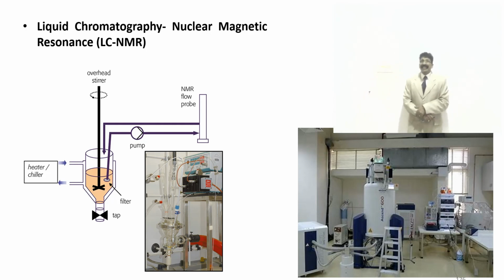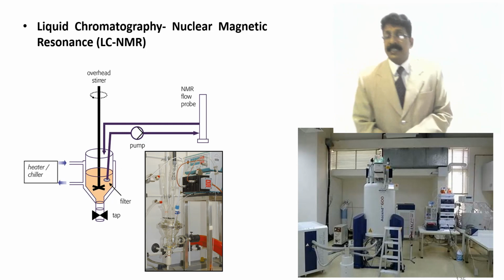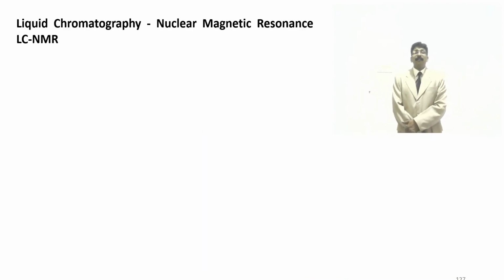So this nuclear magnetic resonance spectroscopy connected with HPLC or liquid chromatography is called LC-NMR, liquid chromatography nuclear magnetic resonance.